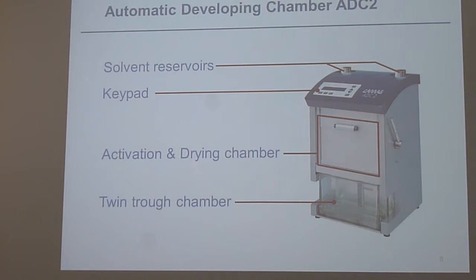But as the tank is not exactly at the same height as the original one, it can be that the plate lowering is not exactly the same. Therefore, the humidity or the developing distance could be different. What if the customer broke the chamber and wants to purchase a new one?